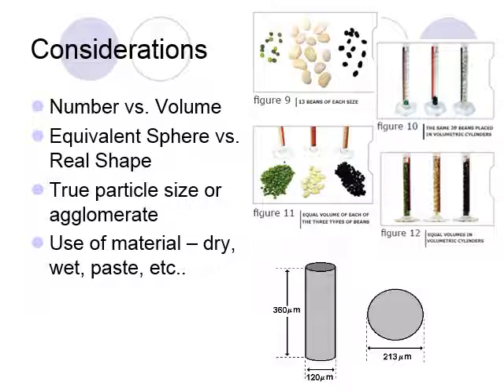You also have to consider, when you particle size test, if you are looking for the actual particle size, or are you concerned with, because of your process, the agglomerate size. I have this talk with customers pretty often. People call me and want me to test a particle size measurement exactly as they send it, and I will sometimes say to them, well, your particles are actually smaller than they look like. They're just agglomerated. And if I don't break apart the agglomerates, you're not really getting a particle size.